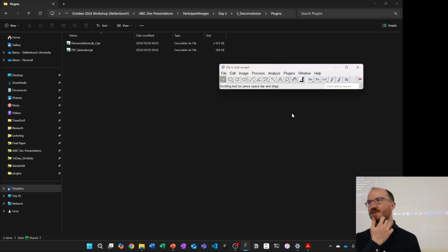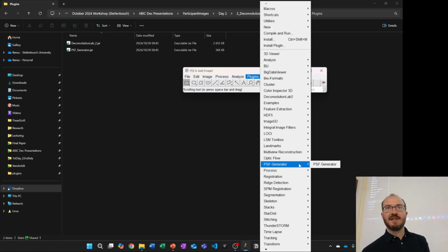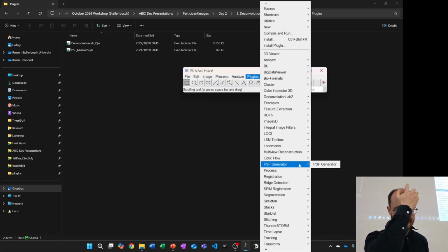It would also just be good because, like I said, with some microscopes, you click the acquire button and it already deconvolves the samples for you. So just make sure that if it has done that, you don't deconvolve them again, because then you're going to start destroying the actual information. Okay, does everybody see that? Okay. I just saw the guy back there.